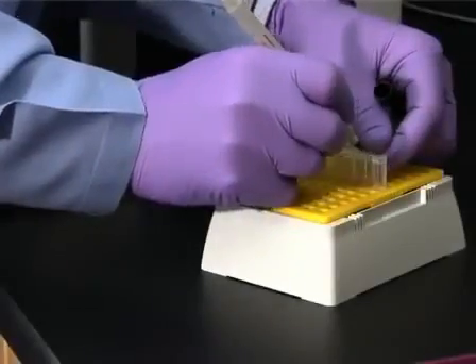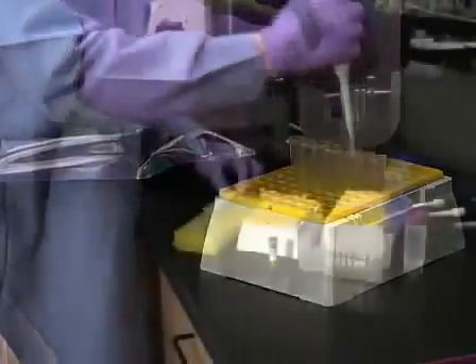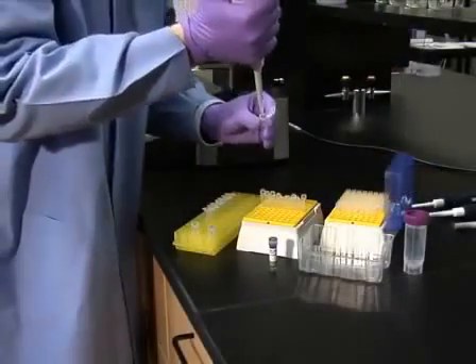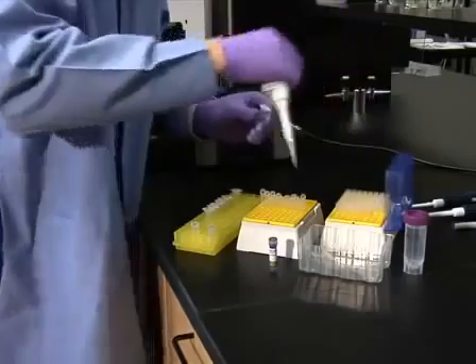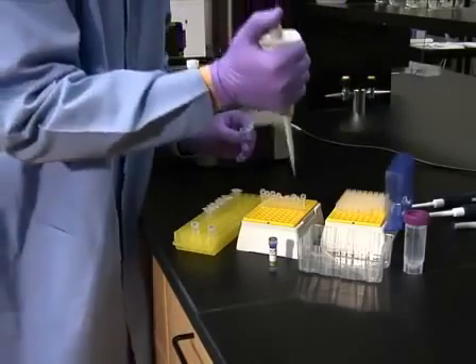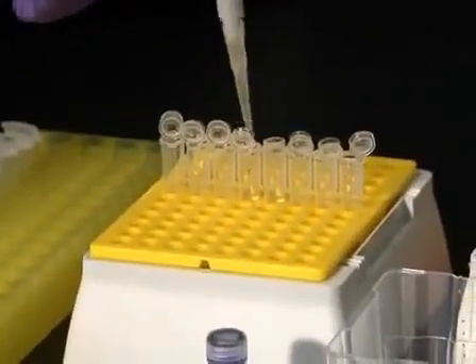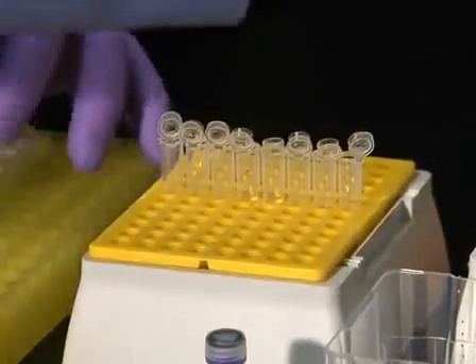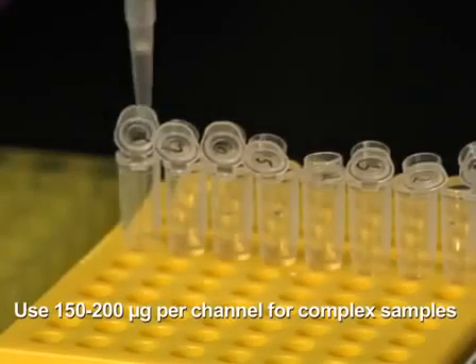Begin this procedure by setting up and labeling up to eight 500 microliter tubes. To each tube, add up to one milligram of the protein sample in a volume of up to 112 microliters. The amount of protein in the sample depends on the complexity of the sample. For more complex samples, such as the tissue homogenate used for this demonstration, 150 to 200 micrograms per channel will generate the best results.